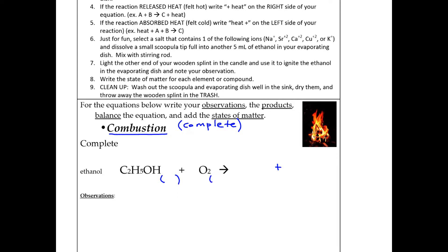You combine that by burning it, it combined with oxygen from the air, so you know the state of matter there. And you know that for complete combustion, you're going to make two products: carbon dioxide and water. And you know that carbon dioxide is going right into the air and the water also went right into the air.